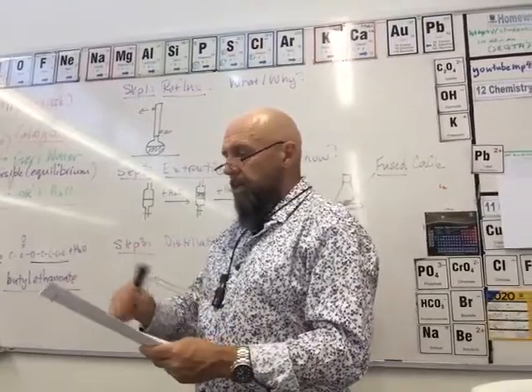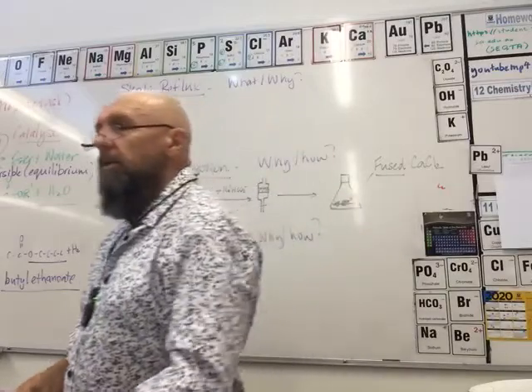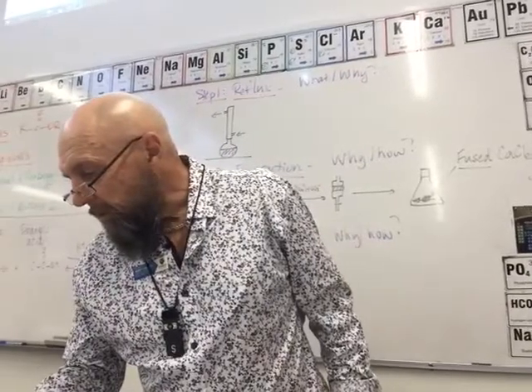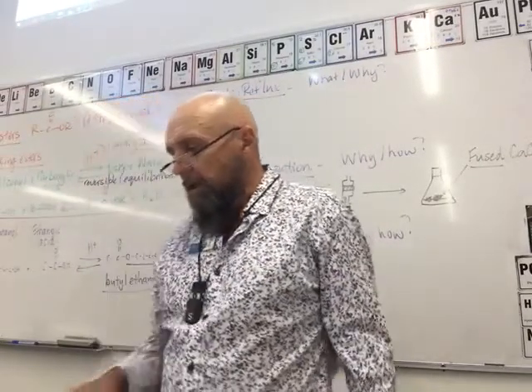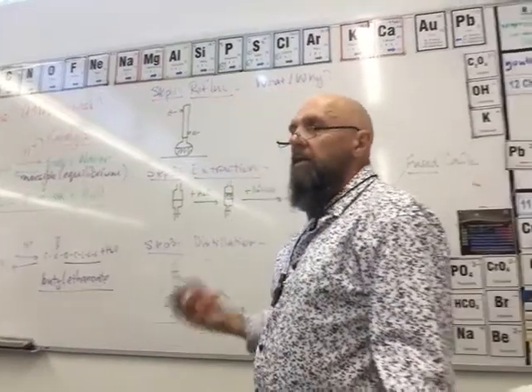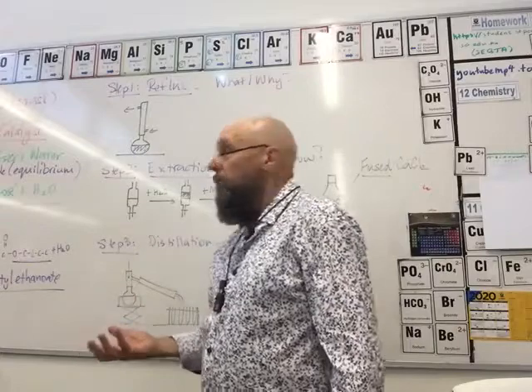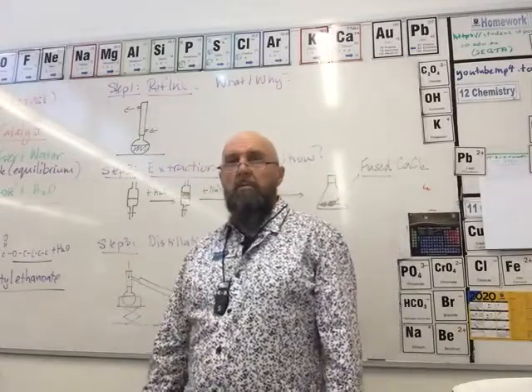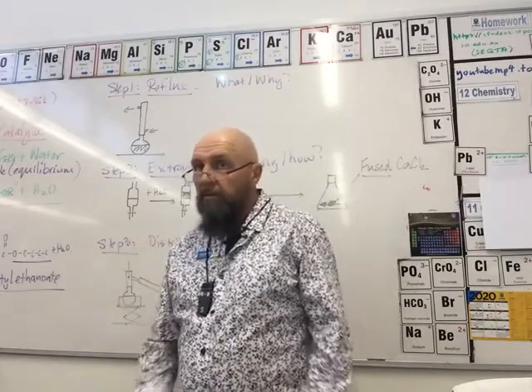Following the procedure, there's a certain sequence of things that you have to do. You start off with your alcohol and your ethanoic acid. We mix those 2 things together in the round bottom flask, and then we add the concentrated acid. Then we wait for it to cool down, and then we start the reflux process. Have you ever done reflux before? Of course you haven't.